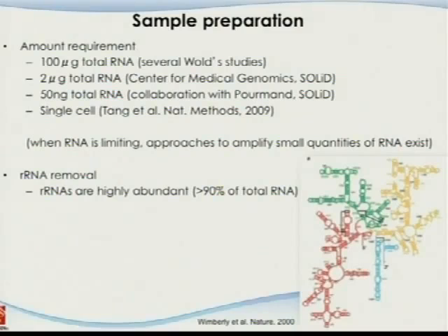But it turns out, and I don't know the reason for that, over 99% of our reads are on the ribosome RNA. One of the reasons, probably, and I don't know the bacterial system very well, the rumor is they don't have polyadenylation, so they don't really do the protection. So those RNAs degrade pretty fast.